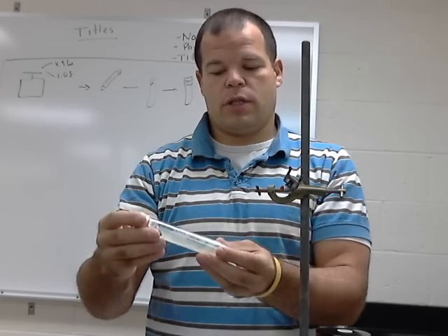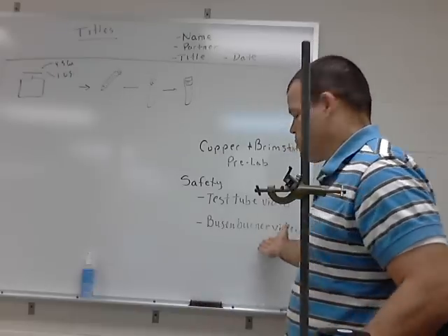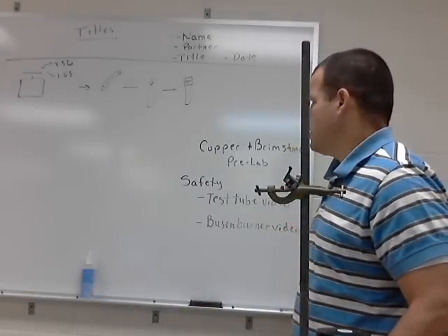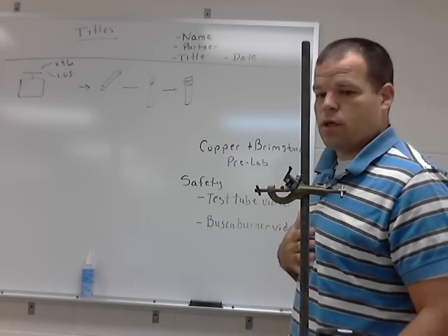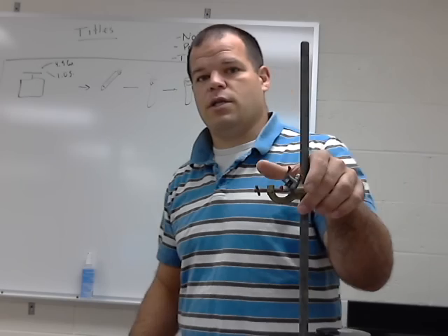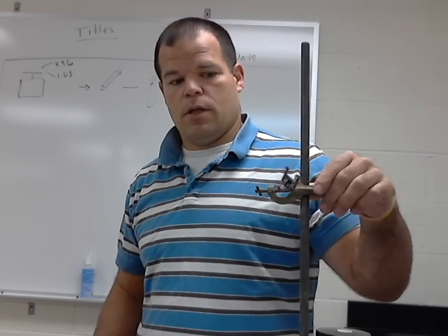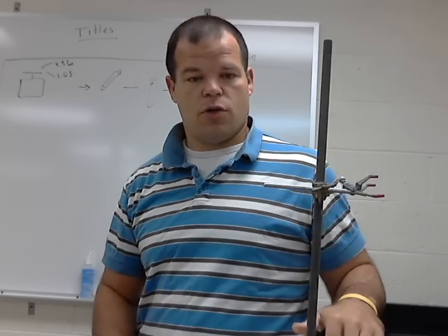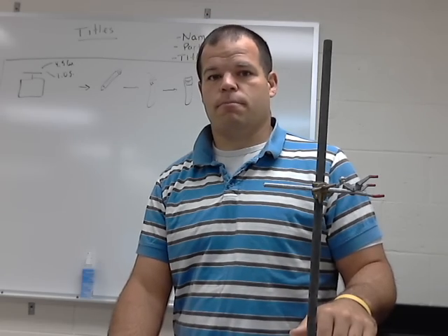So this is our first lab. A few things we covered here are some safety concerns for this particular lab, and how to set up your lab book so when you come to the lab you're all ready to go. We've also talked about a few things involving the setup of the copper and brimstone lab. We will not be covering this in class, so this is for your knowledge, and you are expected to do this when you come to class. Okay? Thank you.